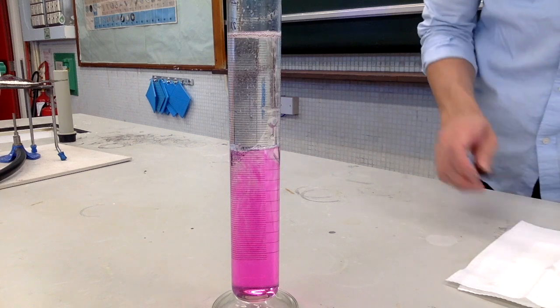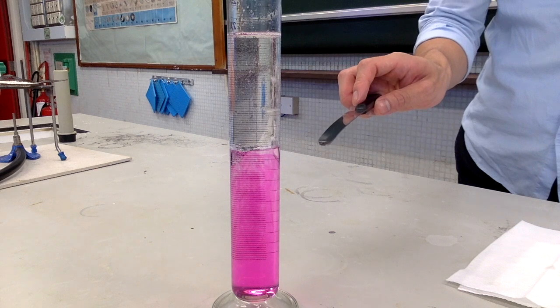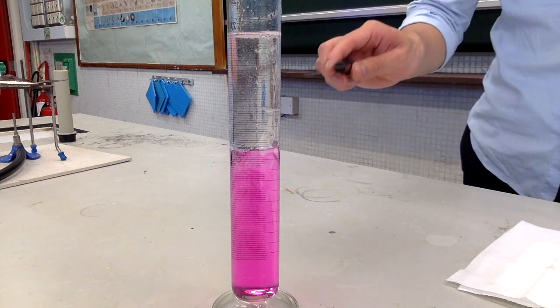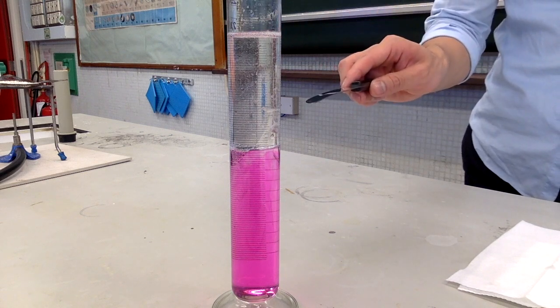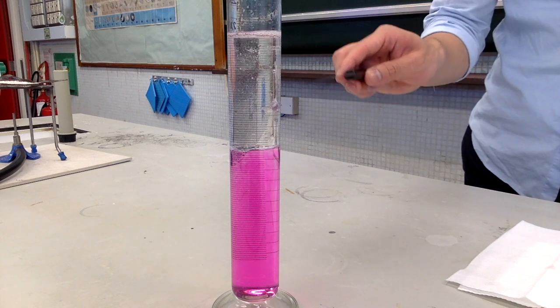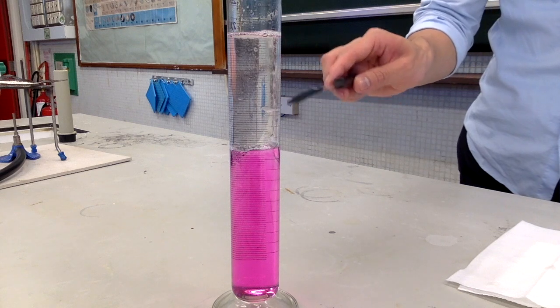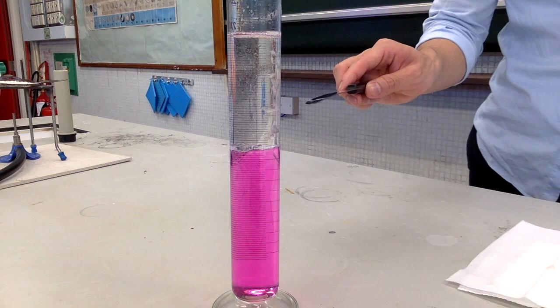Now, as you can see, the metal jumps up and down as we introduce the metal. First of all, the reason why the metal sinks in the paraffin oil is because the sodium metal is denser than paraffin oil. Plus, there is no reaction between sodium and paraffin oil. So that's why at the beginning it sinks.